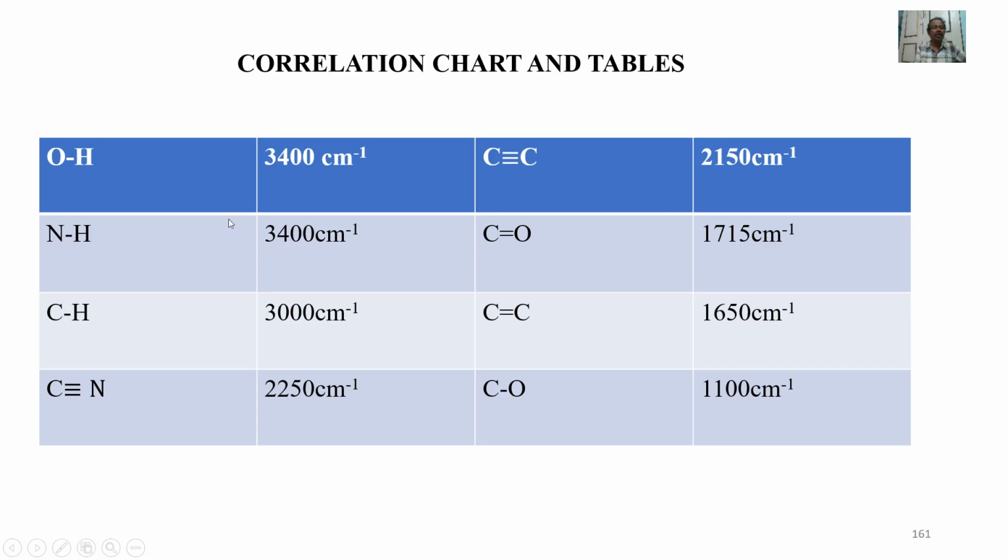By means of sharpness and smoothness, one can differentiate. And the second one is either it should be strong or it should be weak. So we can differentiate these two. Here you have OH and NH stretching. These two numbers are the same. How to differentiate? Only by means of either sharpness or smoothness, and otherwise strong, weak, medium, one can differentiate.